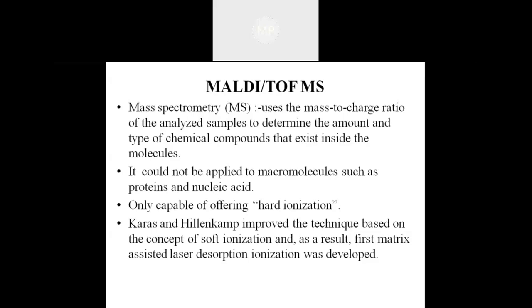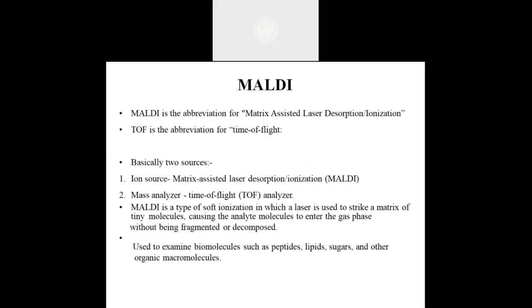So Karas and Hillenkamp improved the technique based on the concept of soft ionization. As a result, the first matrix-assisted laser desorption ionization was developed. Moving to the next slide, this is the MALDI.